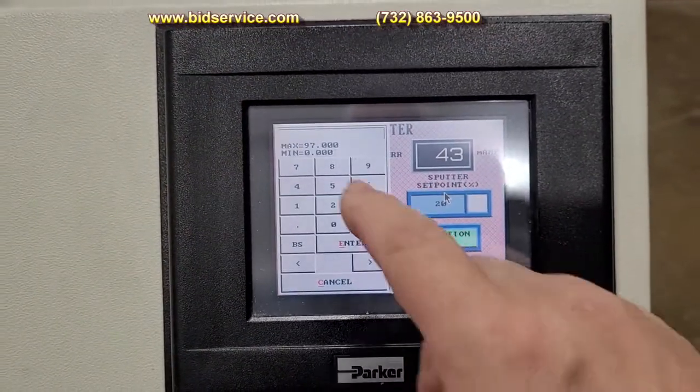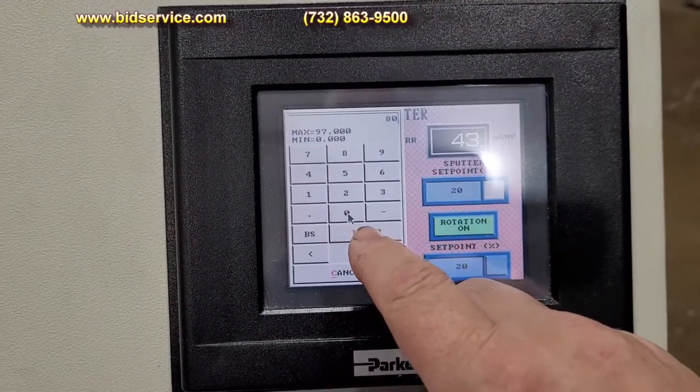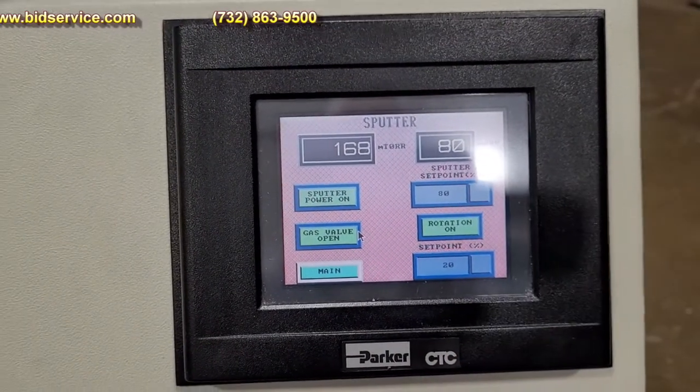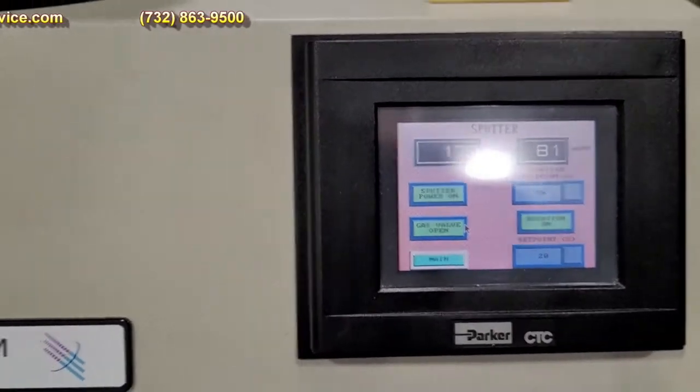And then I'm going to turn it up to 80, and you can see the amps going up, as well as the millitorr when creating the ions.